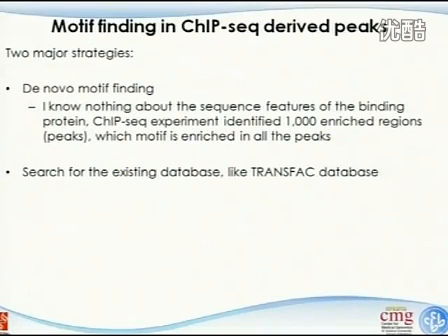Okay, now let's get back to the topic of ChIP-seq. All right, motif finding in ChIP-seq derived peaks. There are two major strategies when we look at the ChIP-seq data and want to study what the motif is in those regions we identified. At this stage, we assume we already identified the regions, okay, based on peak finders or some other algorithms.